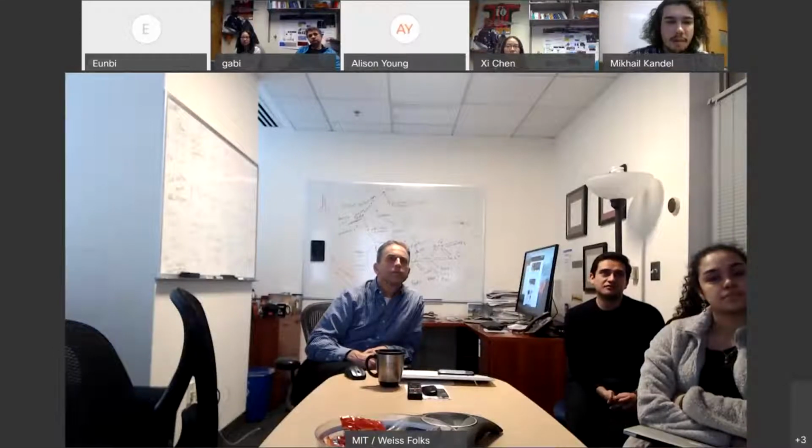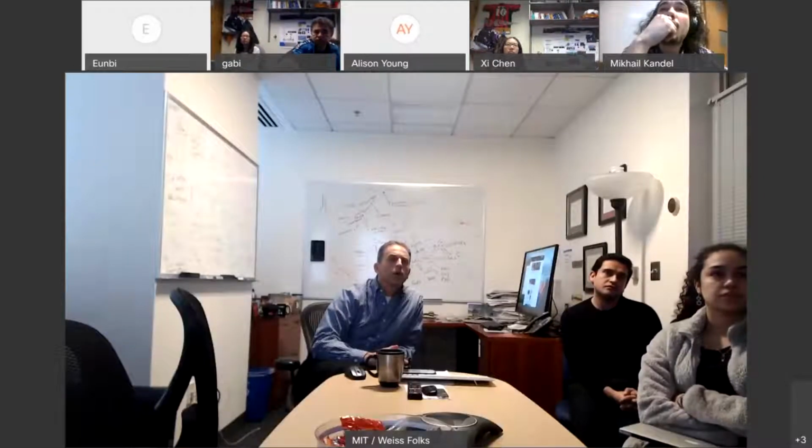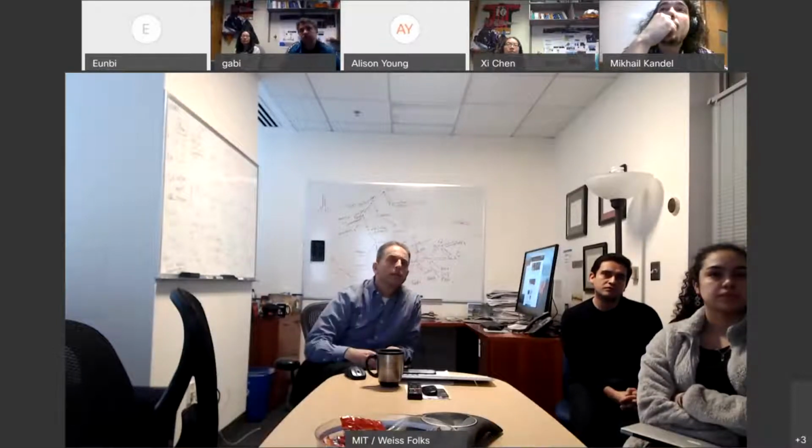Yeah, so first off, the neural network is trained at the end. So it basically works for any type after it's trained. Some of the images I've been showing were, so we've had CHO cells as well as SW cells. What I was alluding to is that you can train it for the different cell types.